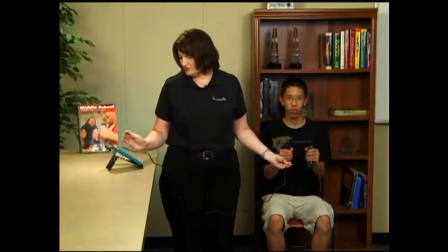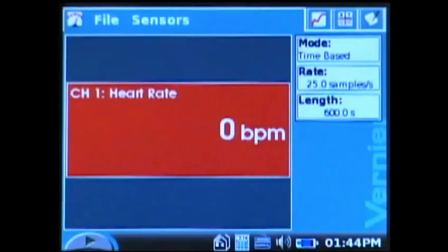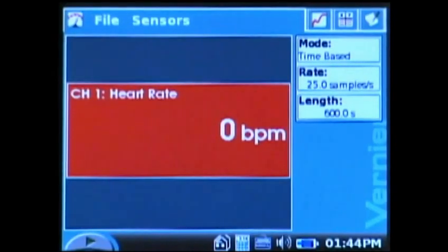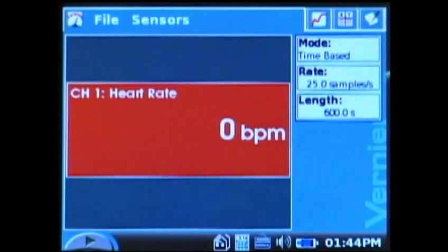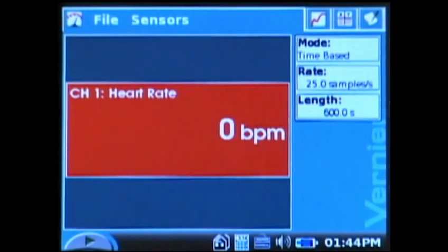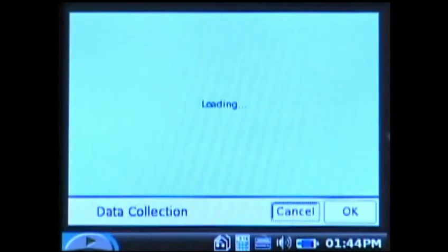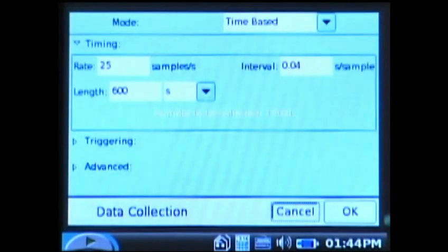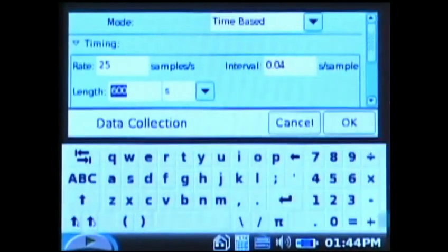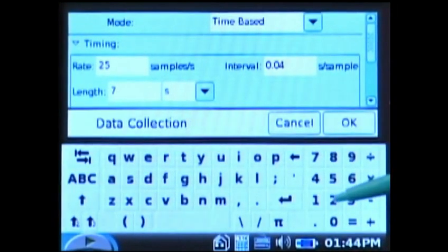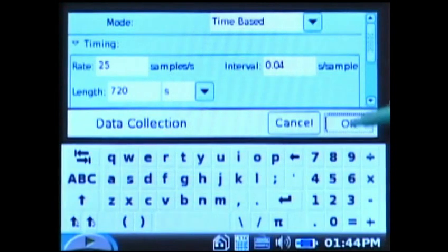The first thing I need to do is do one little change on the LabQuest app. The default rate and length for the hand grip heart rate monitor is 25 samples per second and a length of 600 seconds. We need to lengthen that to 720 seconds. So I'll tap on the length and change that 600 to 720 and say OK.